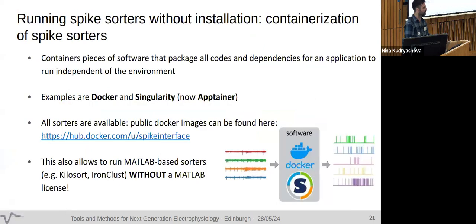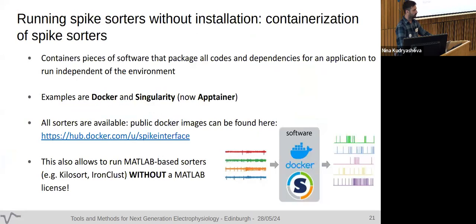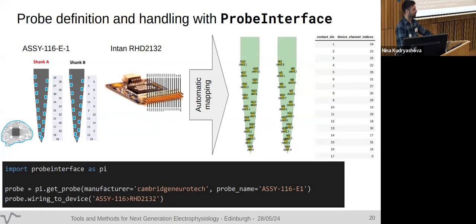I think you can't actually flip it backwards, you're supposed to flip it the direct way. He's saying, if you put the actual headstage on backwards, this would not automatically map backwards. Yeah, I think you need to put it on the correct way. But we can't control that.